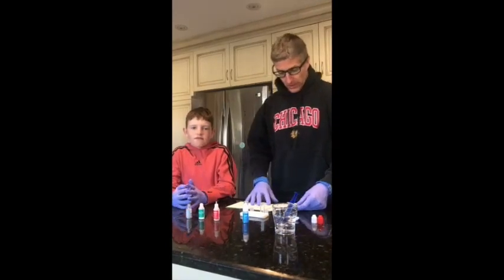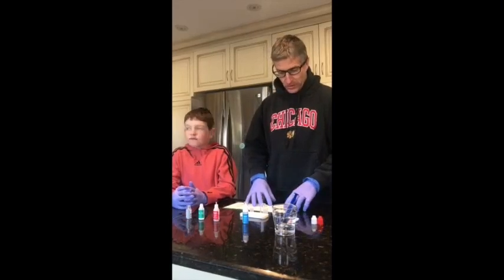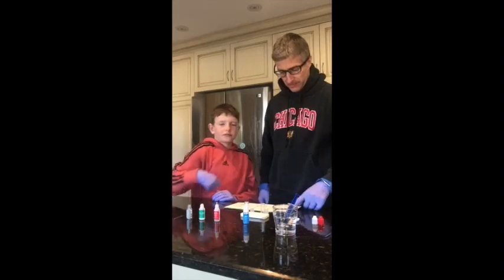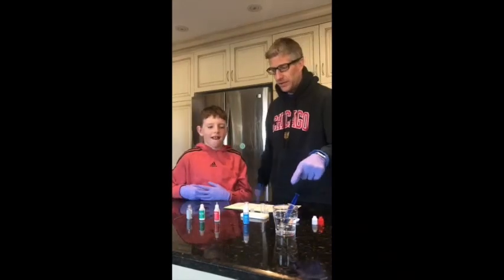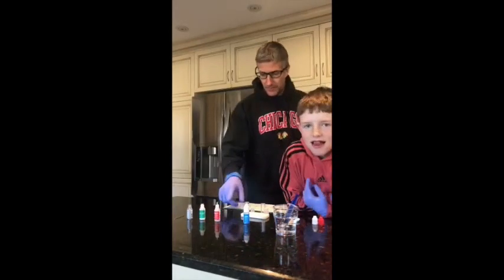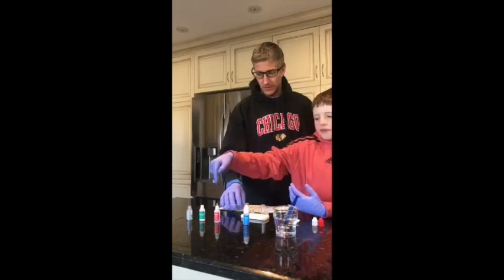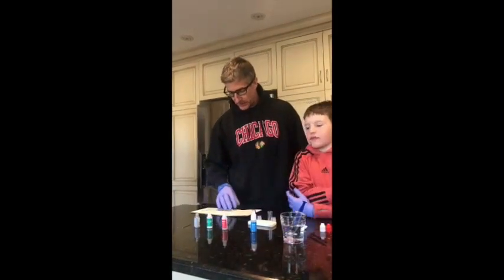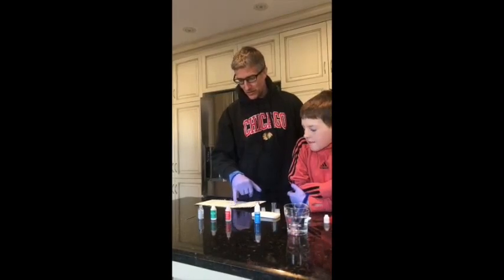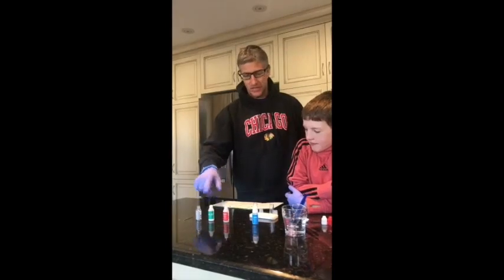So the chemicals that we are working with today are copper sulfate. Duncan's going to point to the copper sulfate. Okay. We have some water here. Duncan, just stand in front of us. We have some tin chloride right here. Point to that one, please, Duncan. We have some NaHSO4 right here. And we have pieces of zinc right here.